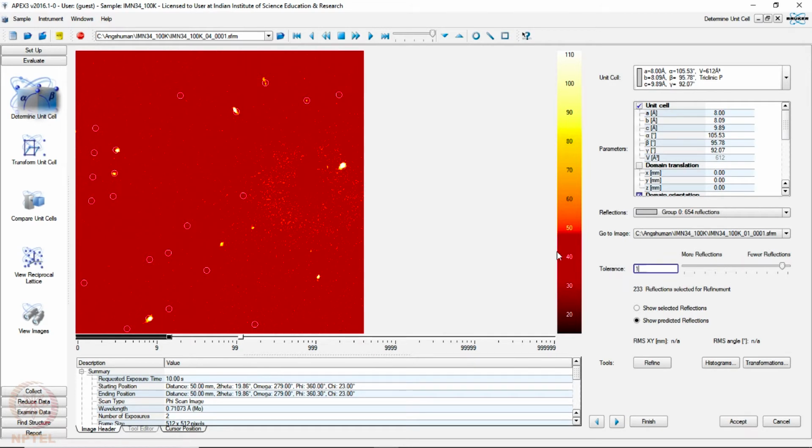And that is why it is immensely important that one does the centering very carefully, and makes sure that the crystal is not loose or the sample holder is not loose and it is not moving in the beam during data collection.